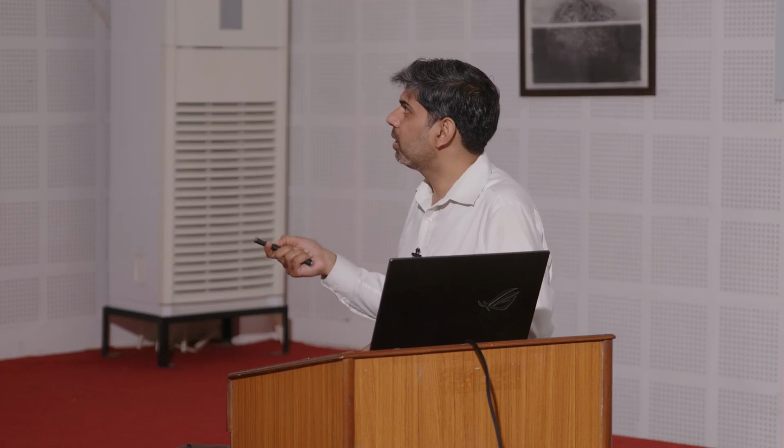Now, there is another way, typically an easy way, but it also has some drawbacks, of increasing the sensitivity of the separation. What we do is use a technique called field amplified sample stacking. Just focus on this picture over here.